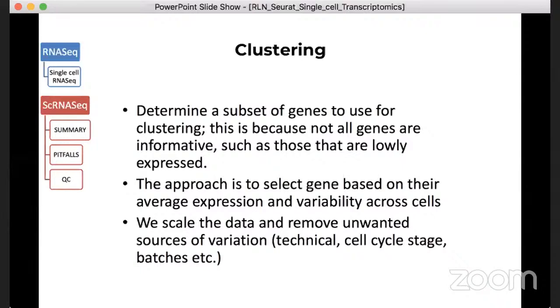All these processes will be efficient only when we have filtered out a lot of noise from our data, and have selected only very few top quality genes or features or top quality cells to focus our downstream analysis on.